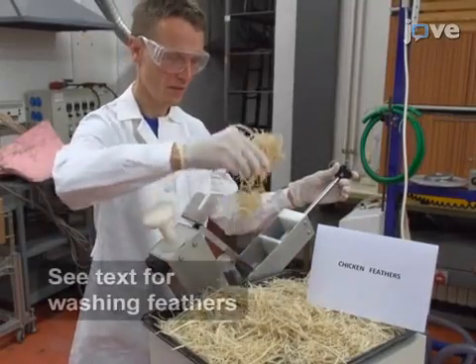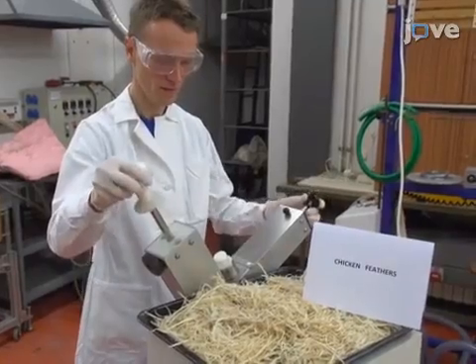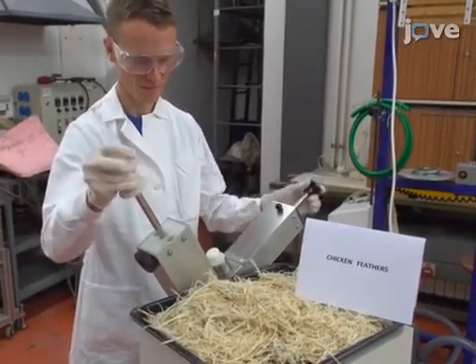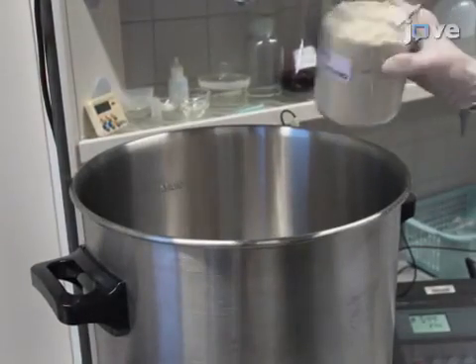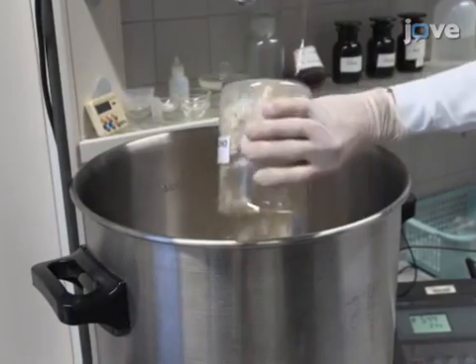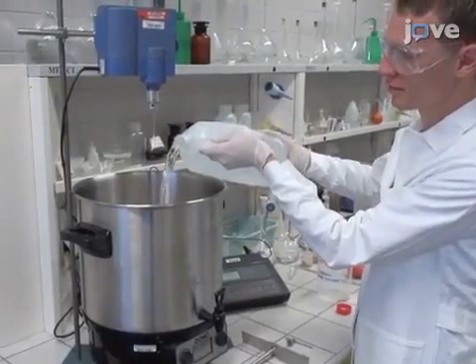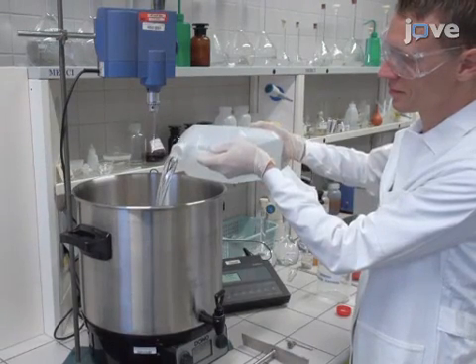To begin, grind 50 grams of dried feathers in a cutting mill into a final fineness of 1.0 millimeters. Next, degrease the feathers in a stainless steel 27-liter boiler container with temperature control. Mix the feathers with water preheated up to 40 plus or minus 2 degrees Celsius in a weight ratio of 1 to 75.